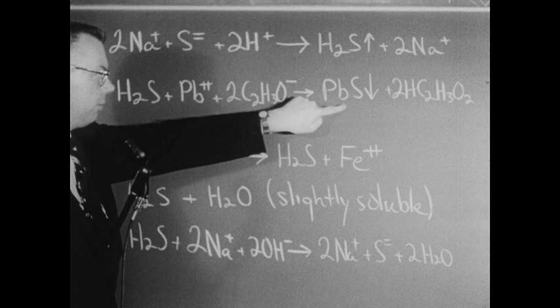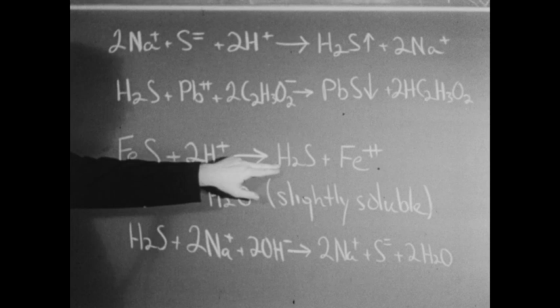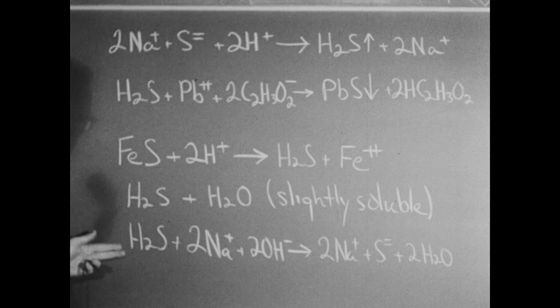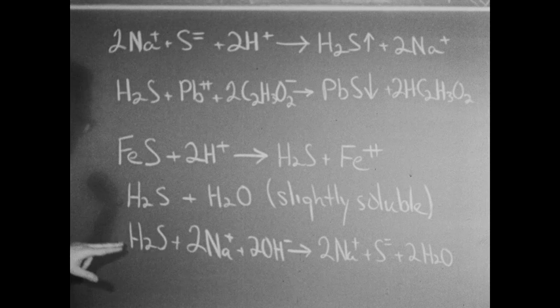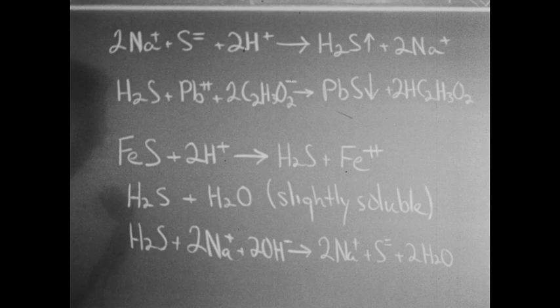The lead acetate paper turned black due to the precipitation of lead sulfide. We then set up a generator utilizing the reaction between ferrous sulfide and hydrochloric acid to produce hydrogen sulfide. We then tested the solubility of hydrogen sulfide in water and in sodium hydroxide solution. We saw that hydrogen sulfide was only slightly soluble in water, but in sodium hydroxide solutions it dissolved rapidly because it reacted with the sodium hydroxide, forming sodium sulfide and water.